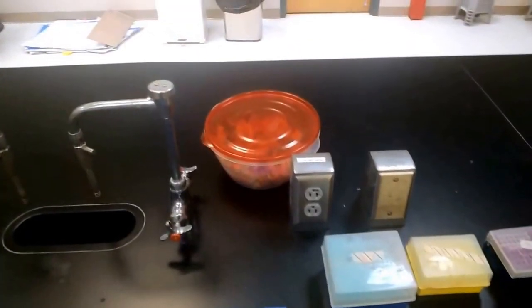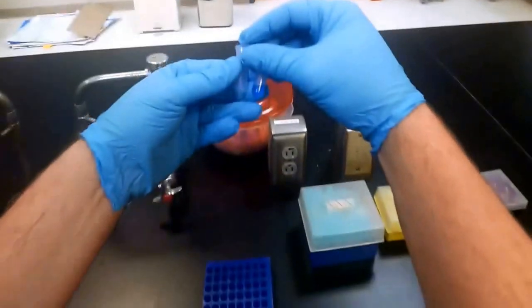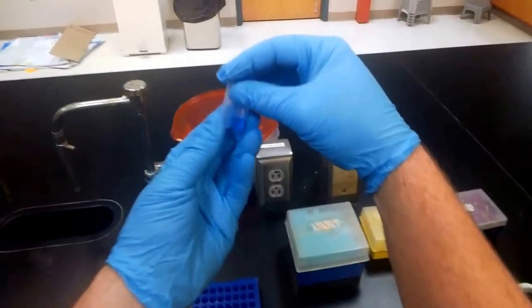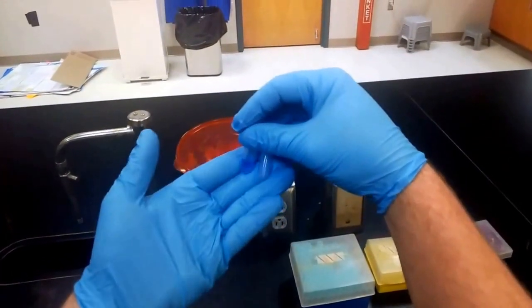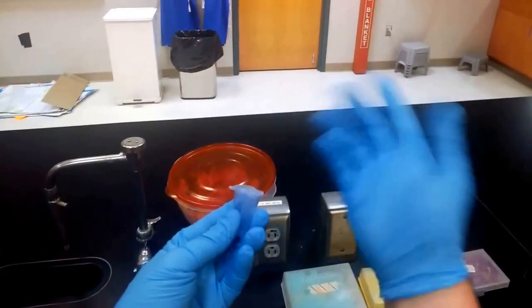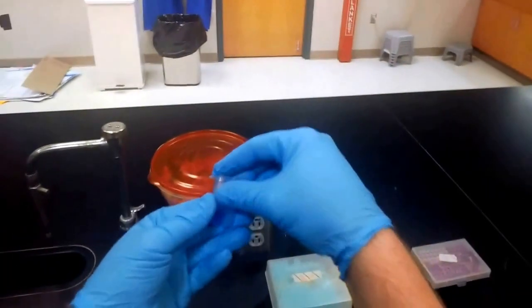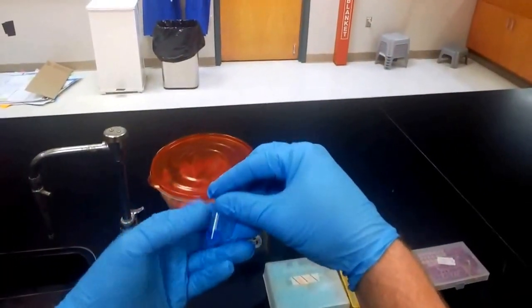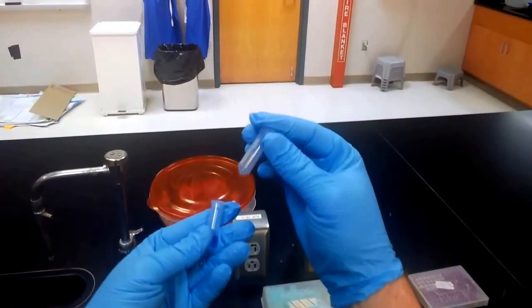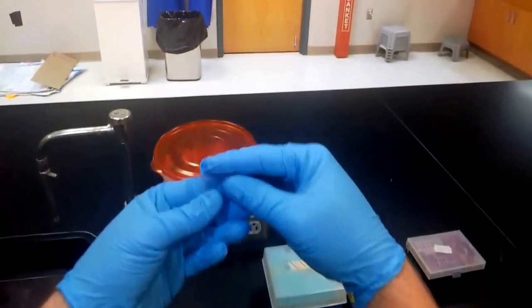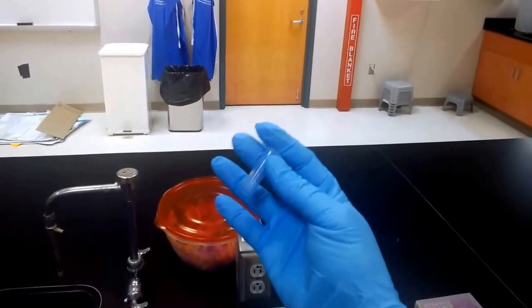Now one thing we know about genetics is that it's operating with DNA, and DNA is very small. So a lot of the experiments conducted in genetics take place in a small quantity of liquid at the bottom of a microcentrifuge tube.